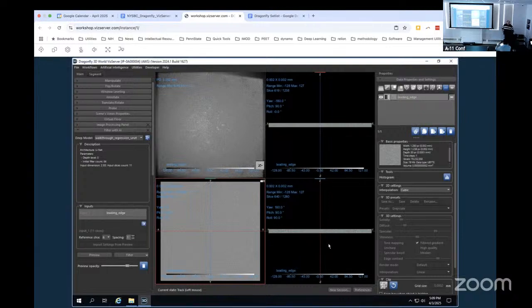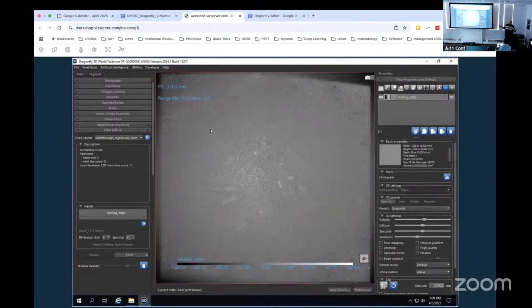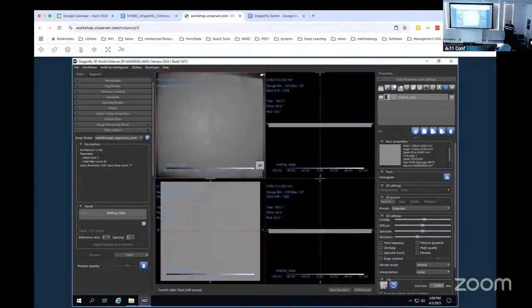All right. That's better. All right, so these quads right here, they're showing you different views. This is X, Y, this is Y, Z, and X, Z, I can't remember exactly. But the one in the top left is a 3D view. I honestly think it's the most useful one. If you double click on it, it should expand and fill your screen. And if you double click on it again, it'll go back to the quad view. And you can look at any of these views that way.